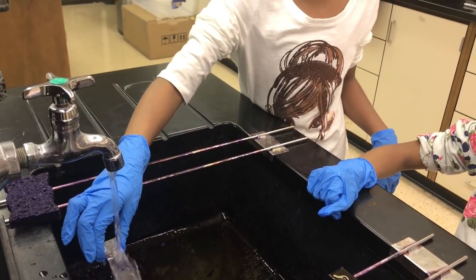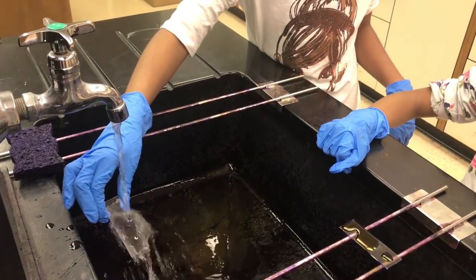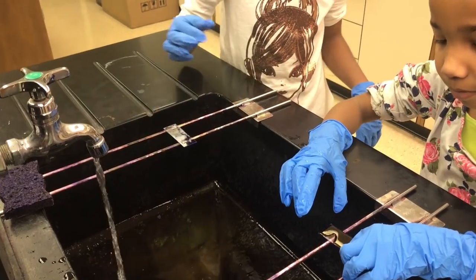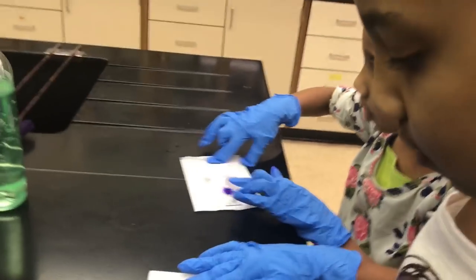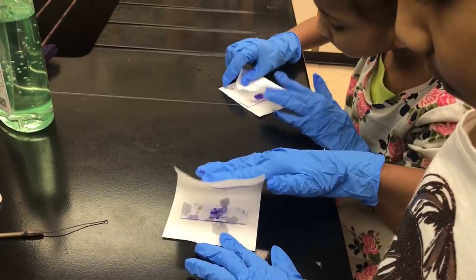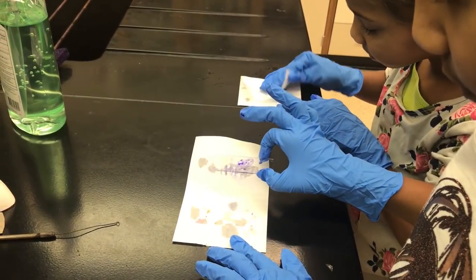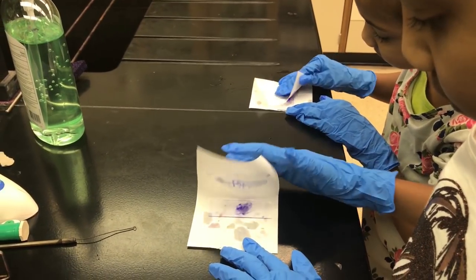Looks so beautiful when it comes off. See, it's purple. Okay, that's good. I'll show you how to dry it. You can't rub it. So, drying the slide, just pat it. Don't scrub. The purple's coming off. It's okay.